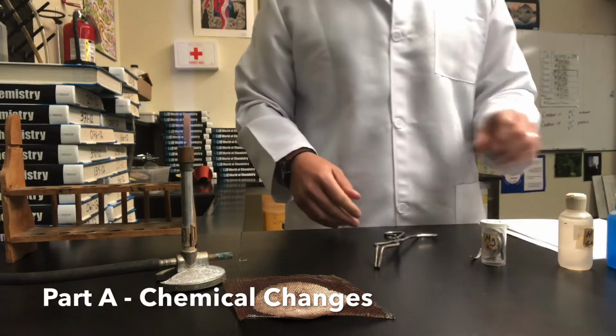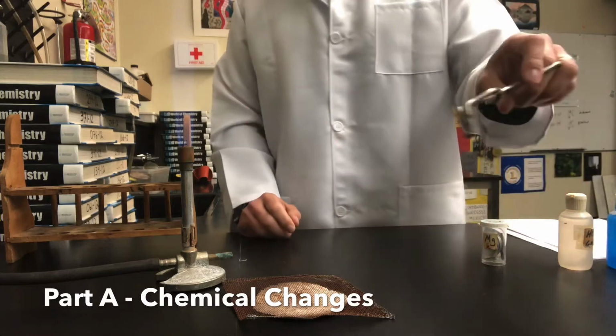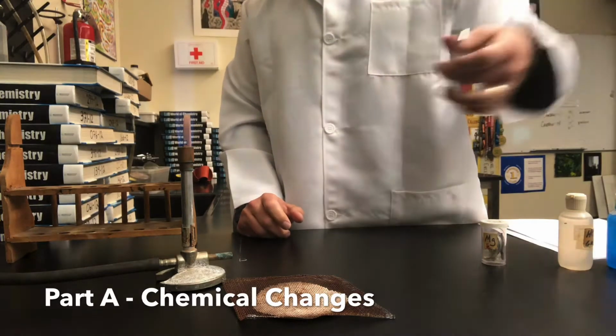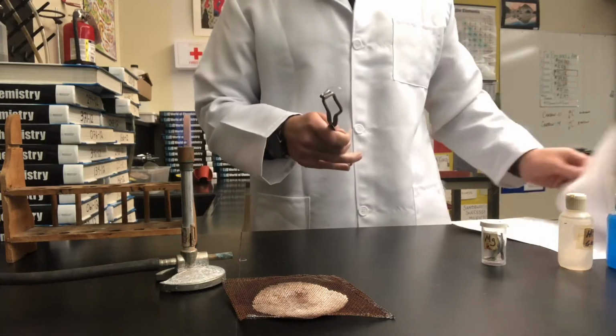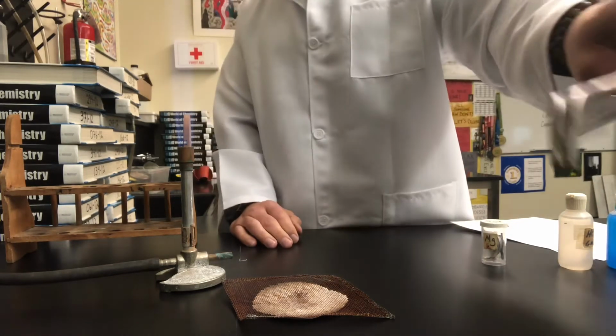The first chemical reaction we're going to start with is actually pure magnesium. What I have here is just a strip of pure magnesium metal. What I'm going to do is heat it up in the Bunsen burner to see if it has a chemical reaction. Now, in order to properly fill in your data table, let's observe before the reaction happens.